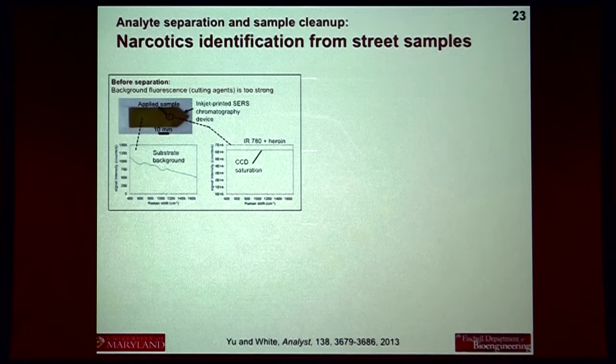But yeah, the cost. TNT is hard to get on the corner in Baltimore, but they figure nobody would pay this much to get high when you can drive up to Baltimore and get high for 5,000 times cheaper. So probably there's no problem with selling it to you. So here's the problem. Street drugs have so many cutting agents, they white out the CCD on the spectrometer.